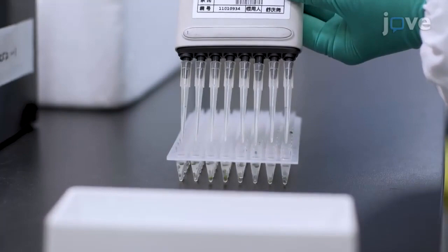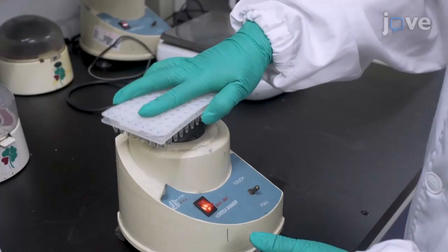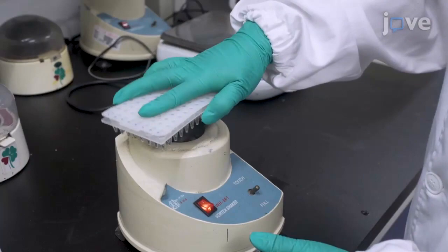Add 50 microliters of buffer B to each well and mix well by vortexing. Centrifuge the plate for one minute at 1500 times G. Collect the supernatant as DNA for PCR.